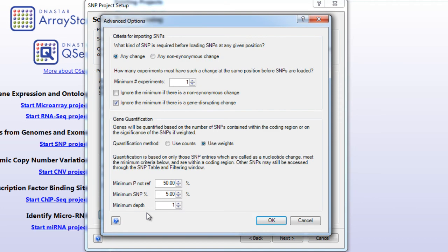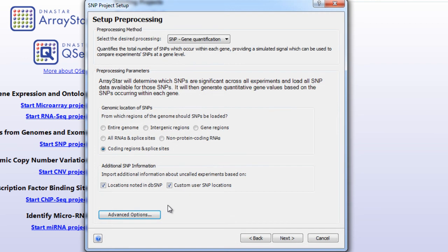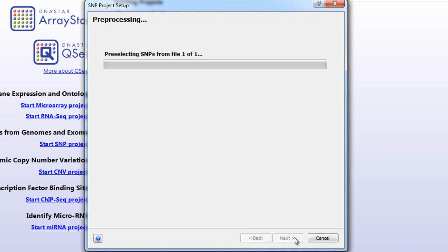and that the Custom User SNP Locations box is checked. In addition, we'll want to make sure that our filtering parameters are consistent. Select Next, and allow ArrayStar to preprocess your SNP project.